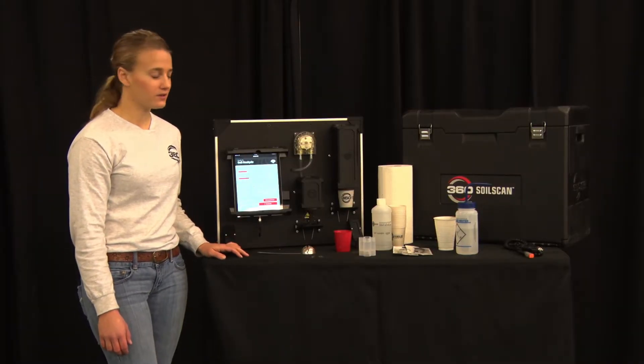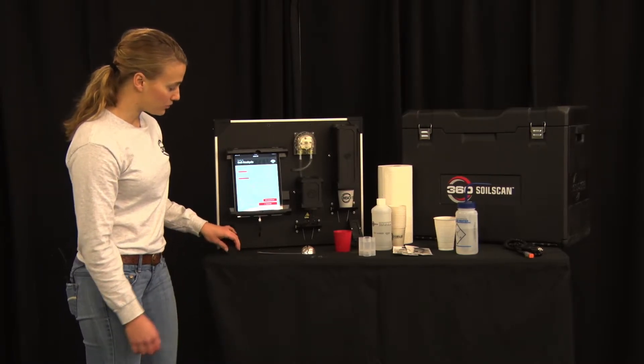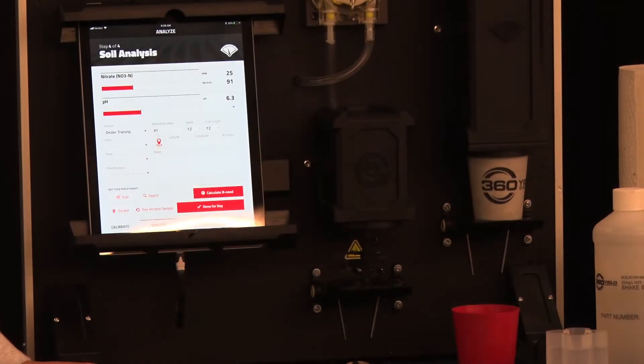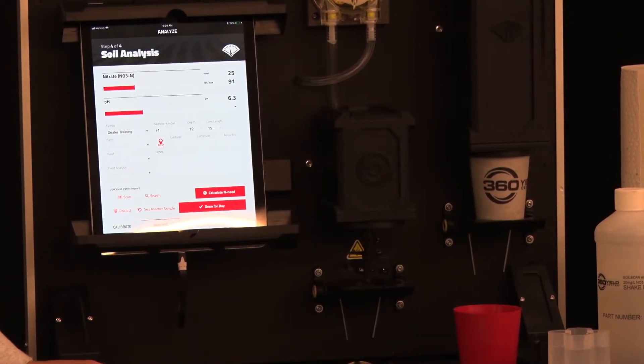When the soil scan has completed its analysis you'll see parts per million and your pH levels. So for this soil that I was testing it's 25 parts per million and 6.3 pH.